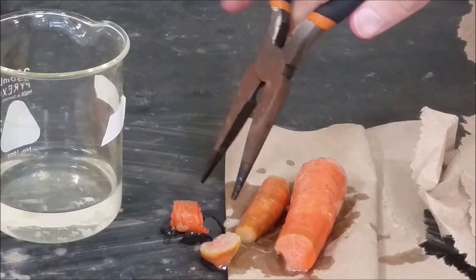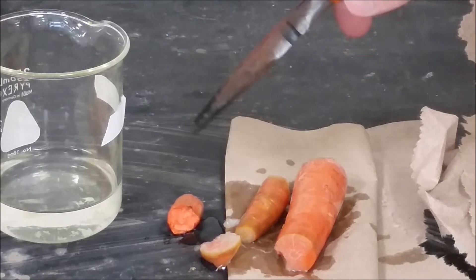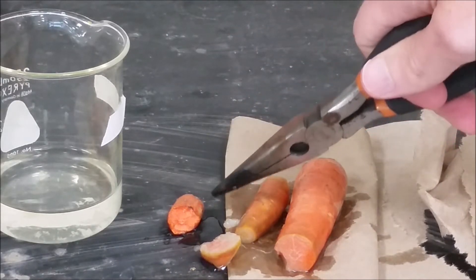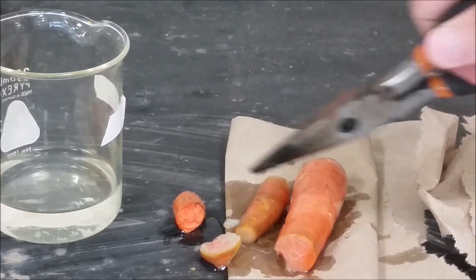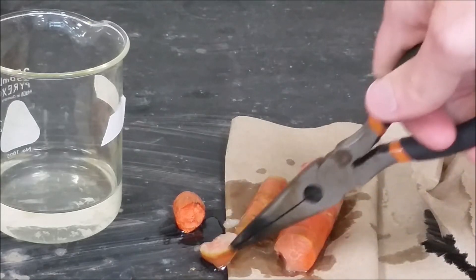So this is the piece of carrot that was left out, not in contact with any bromine. You can see the definite color difference here, the orange between that and this or this or this.